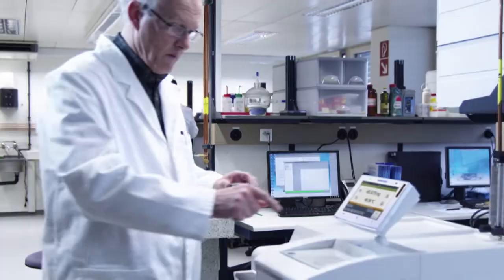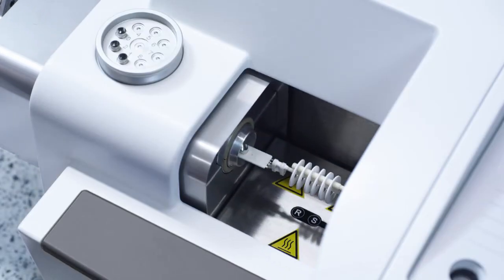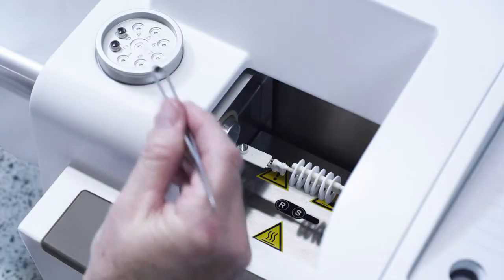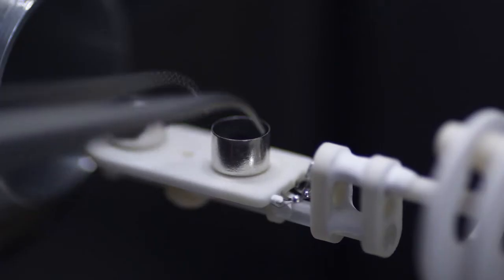Thermogravimetry, or TGA for short, is mainly used to characterize materials with regard to their composition. The Mettler Toledo TGA DSC instruments ensure unbeatable accuracy.